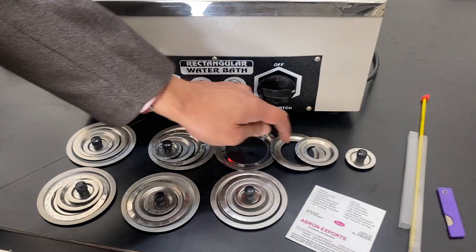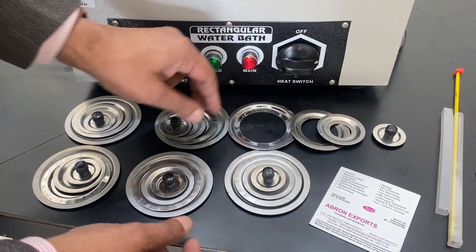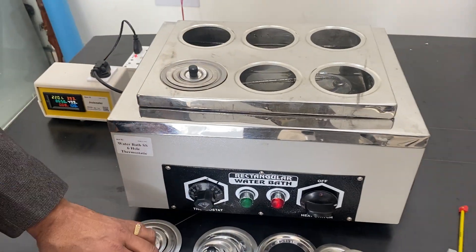Almost 1 kilowatt is the wattage. There are rings — it has four rings — for putting different things. You can put all of them together.